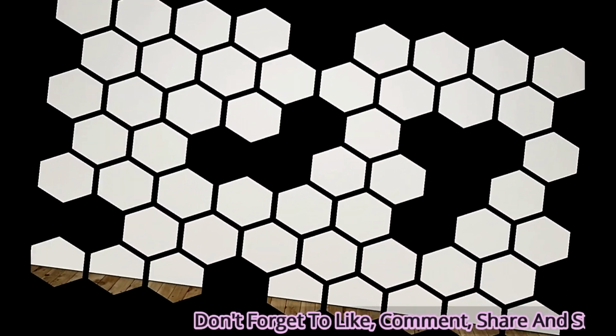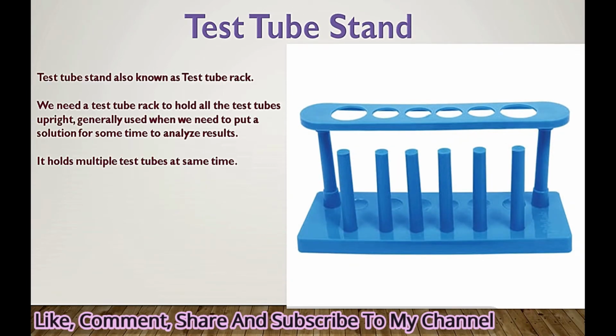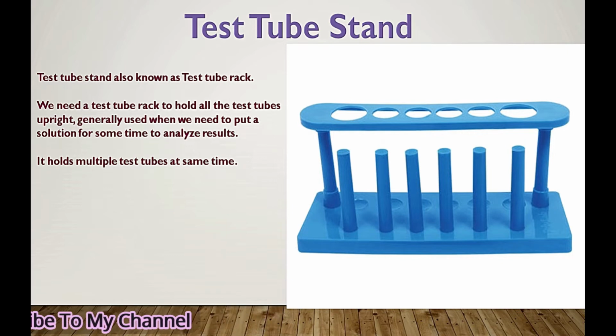Next apparatus is test tube stand. It is also known as test tube rack. We need a test tube rack to hold all the test tubes upright, generally used when we need to put a solution for some time to analyze its result. It holds multiple test tubes at the same time.